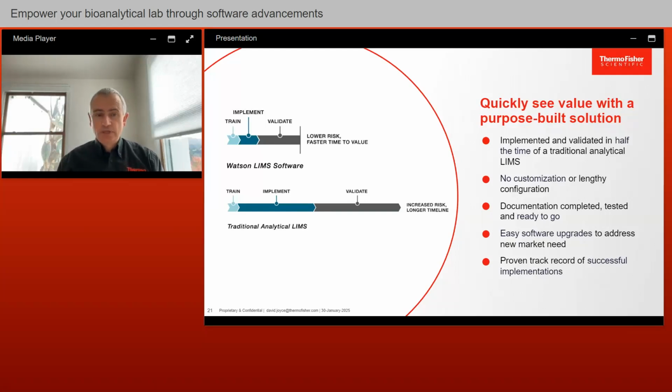Performance qualification, that is kind of the final user acceptance testing and showing that it does what you require in your own context. That's something that still is going to be some work for yourselves. Only you can define that it's doing what you need it to do. But that OQ can be reduced significantly and reduce your time to value by many months.